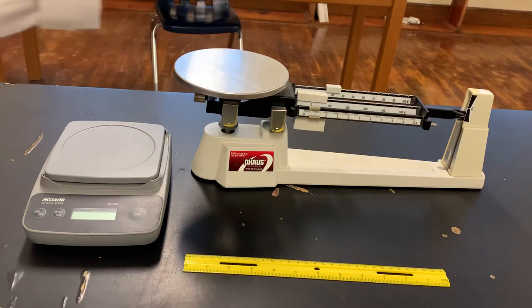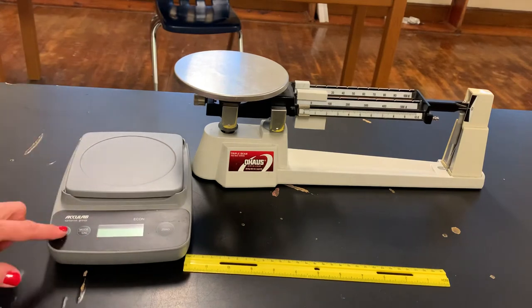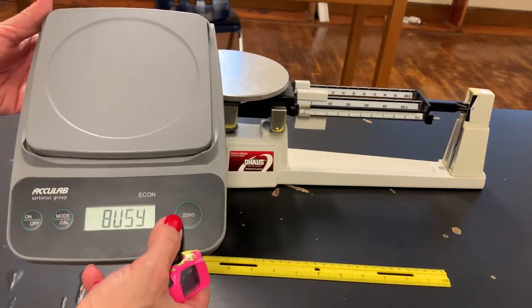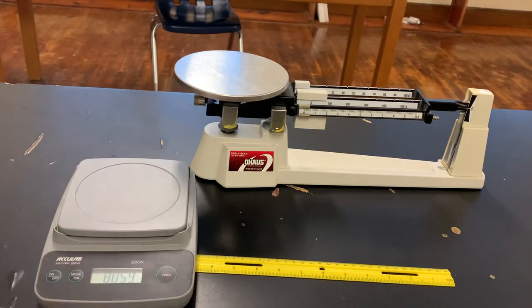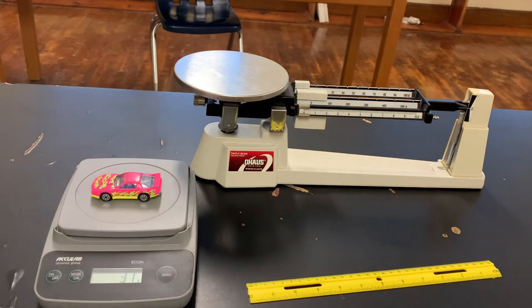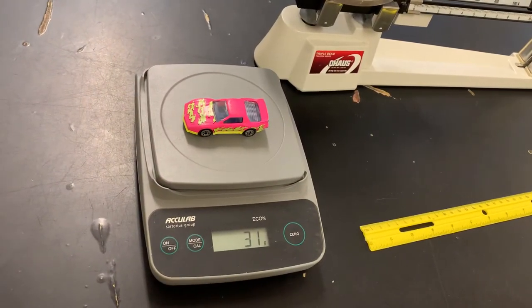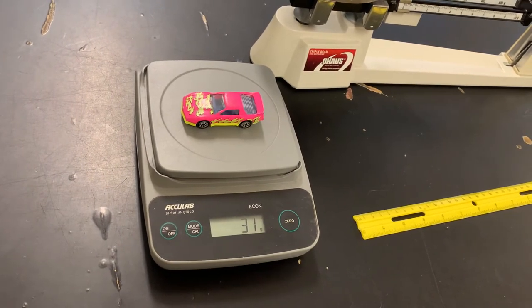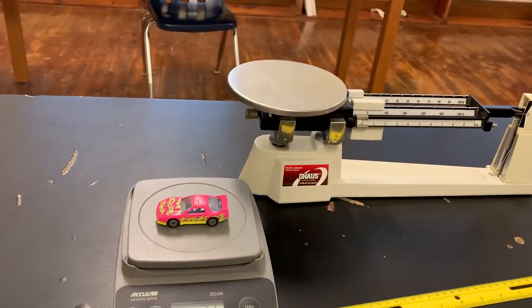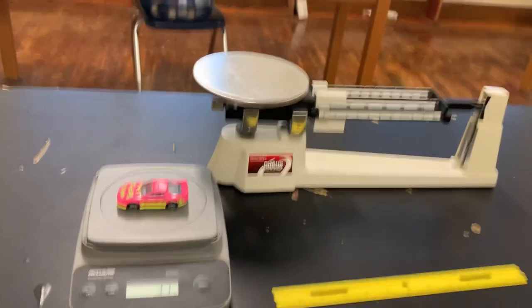Let's check that on the electronic scale. I'll take the car off and zero the triple beam balance again. Now I'll put the car on the electronic scale. When I turn it on, I have to remember to hit the zero button — it says 'busy' while it's zeroing. Then I put the car on and move it closer so you can see it says 31 grams. On the triple beam balance we read 30.9 grams, so we only had one tenth of a gram difference — we did it right.